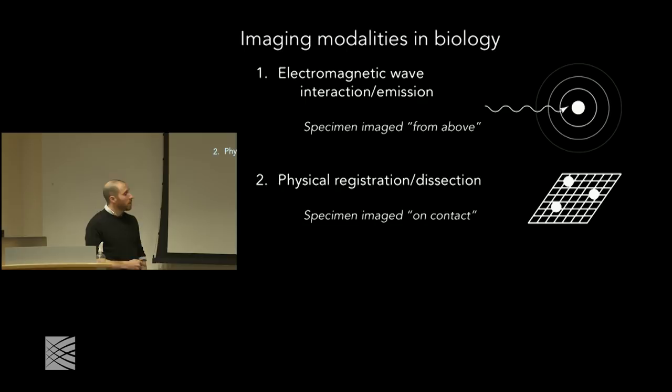If you imagine just closing your eyes and taking a scalpel to a sample and cutting out little pieces of the sample, as long as we know where we're cutting on the sample and we can analyze the little bits that we've cut out afterward, we're able to basically generate some meaningful physical image of the sample. And so we'll call that another modality.